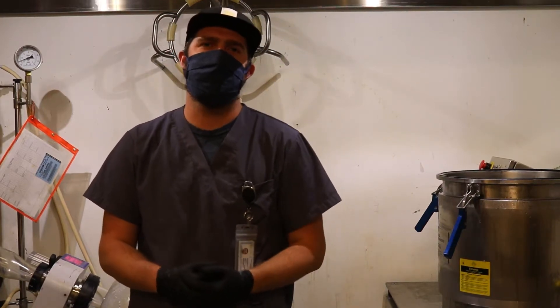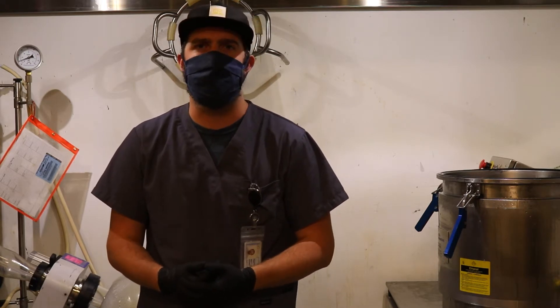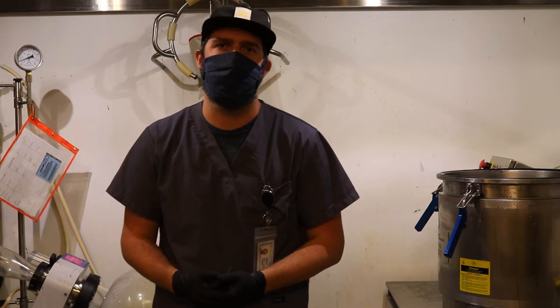Hey, I'm Thomas Stechbeck. I've been the Seer Extraction Manager for close to two years now. I've been with the company close to four. Today I'm going to walk you through our extraction process so you can get a better idea about what goes on in here.